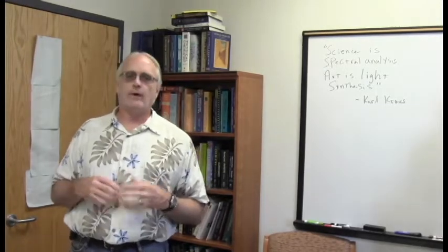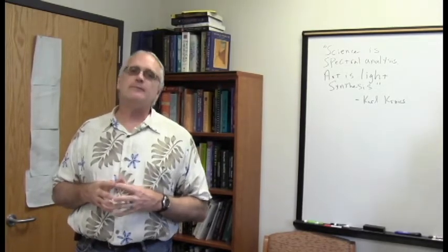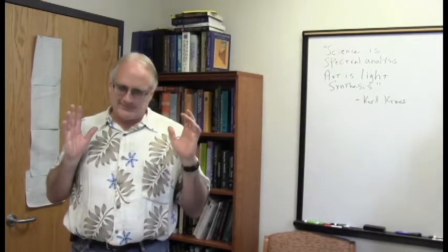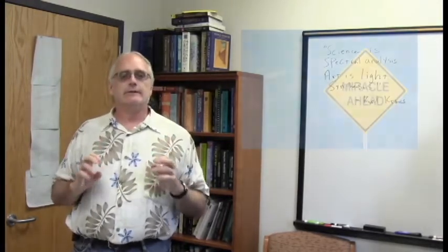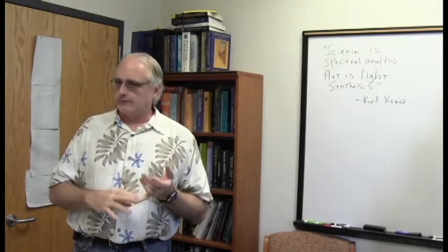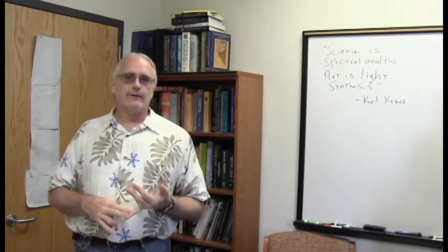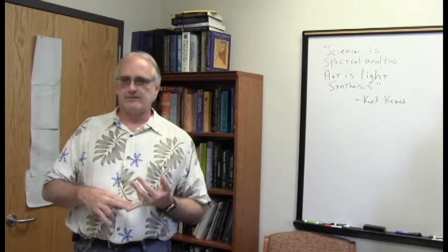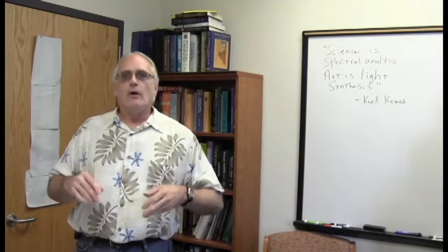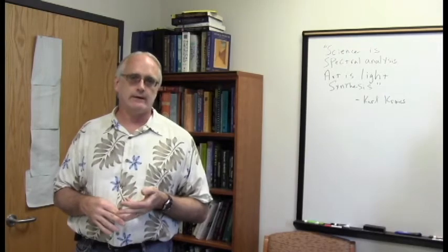So why do we do it? Why do we want to do this to our carbon spectrum? There are a couple of very, very good reasons. Remember, it's a darn near a miracle that we can acquire carbon-13 spectra at all. We have the natural abundance issue with carbon. We have the smaller magnetogyric ratio problem, making the spin state population differences, which already, let's face it, suck when you're dealing with proton, even worse when you're dealing with carbon-13.